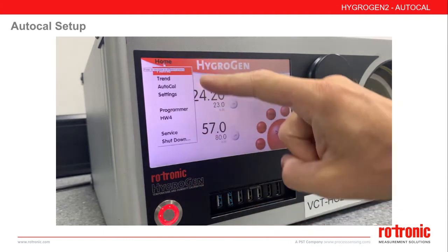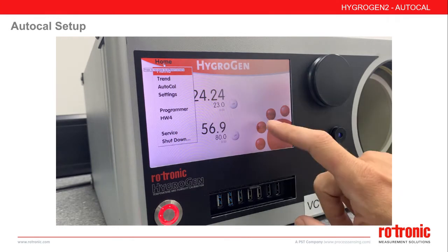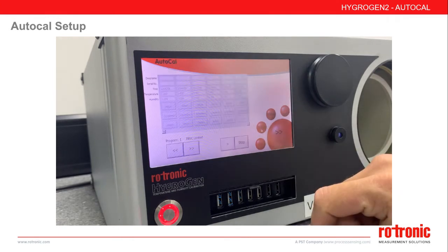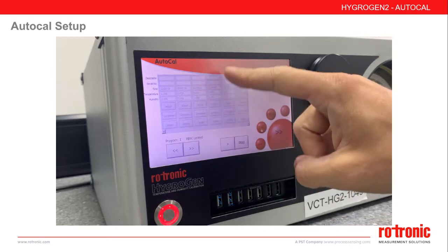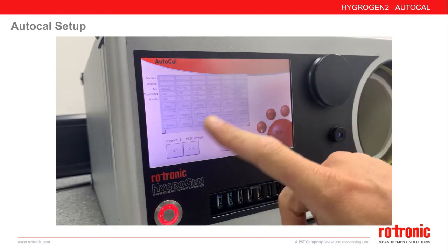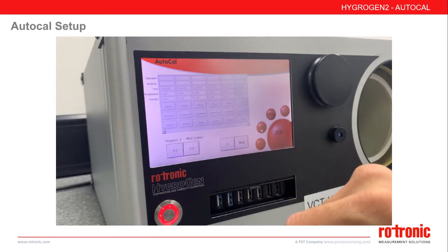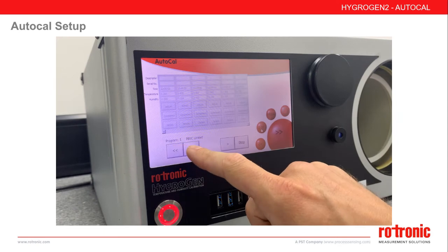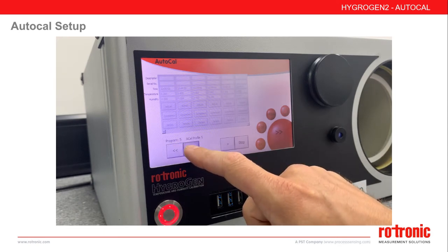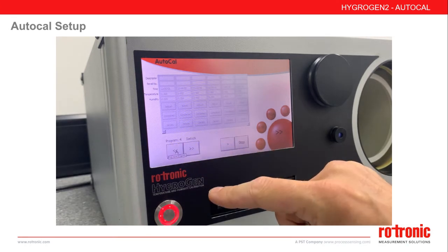The traditional programmer can still be accessed via the home menu screen. Within AutoCal, we see a summary of the reference and any connected probes. At the moment, no probes are connected, so the entire screen is greyed out. Below the main summary, we have any saved programs that can be selected via the left and right buttons, and we also have the start and stop program buttons.